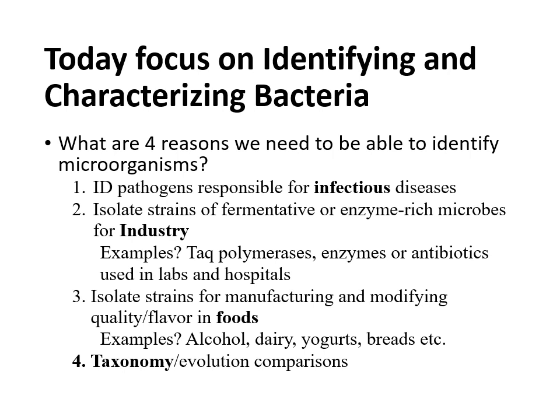So, like I just said, the focus is going to be with regard to unknown bacteria and basically identifying and characterizing bacteria. Now, when you think of dealing with bacteria that exist that you haven't really identified or found yet, there are four main reasons that we end up looking to identify and characterize microbes.